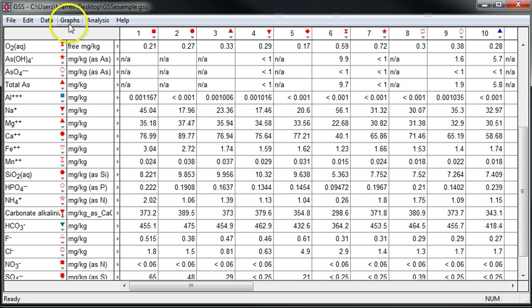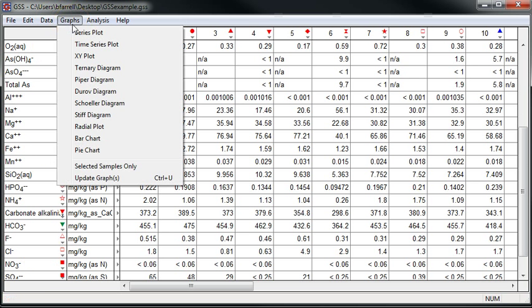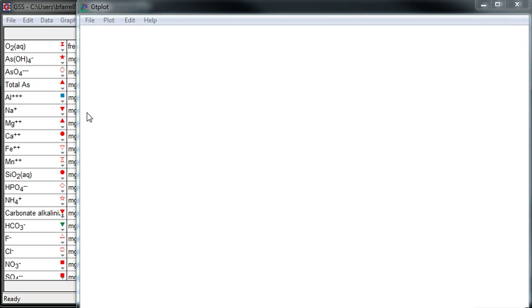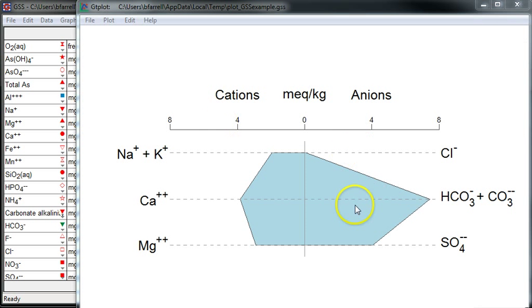To create my plot, I'll move to graphs and choose a stiff diagram. This will open up GTPLOT with the stiff diagram loaded.